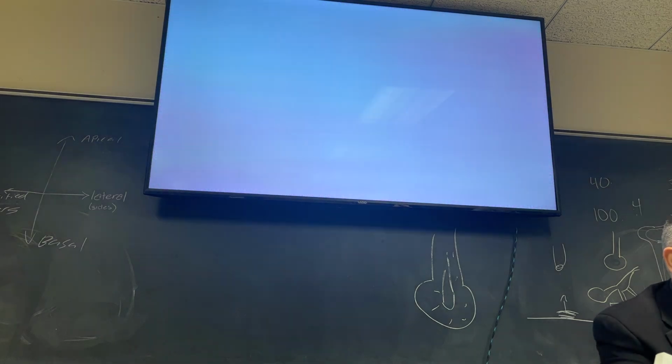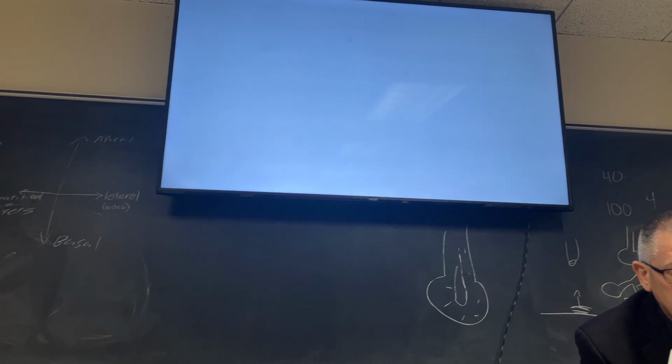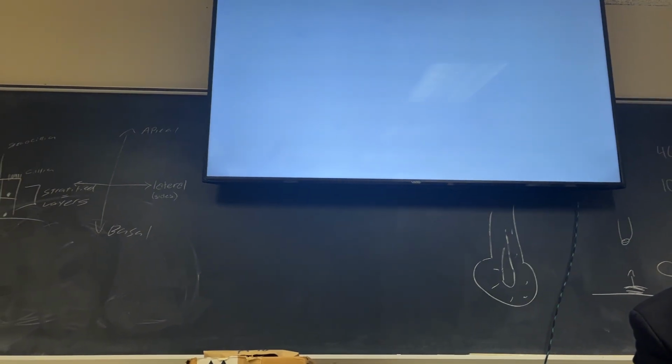All right. This is all the easy stuff. Now we're looking at the peripheral nervous system right now. Yeah, except I don't have the slide I need.